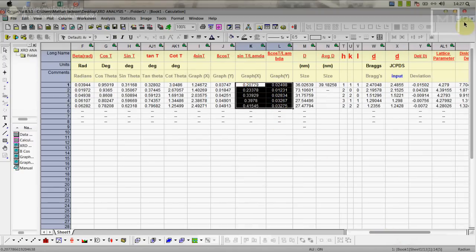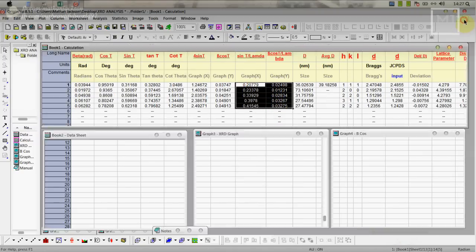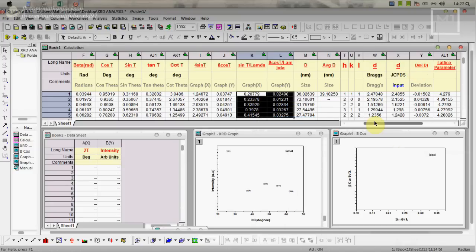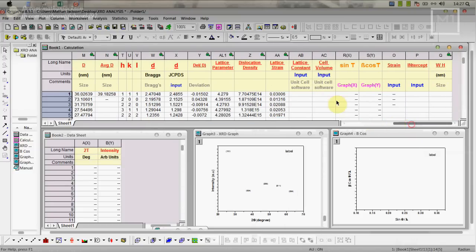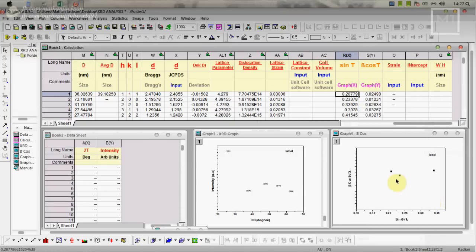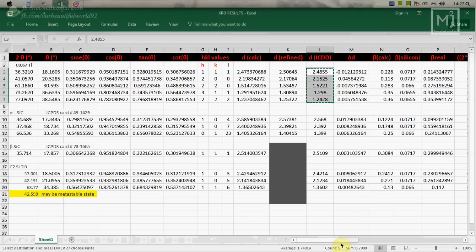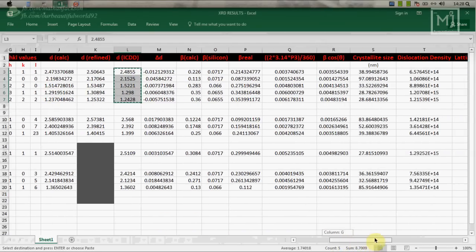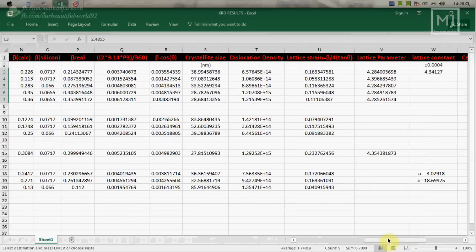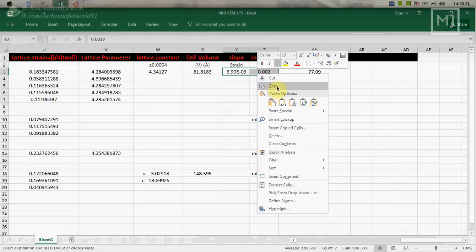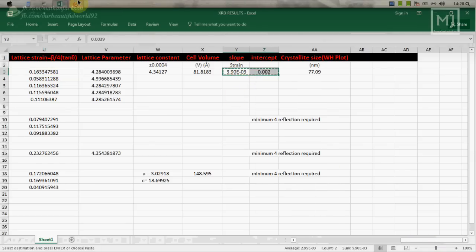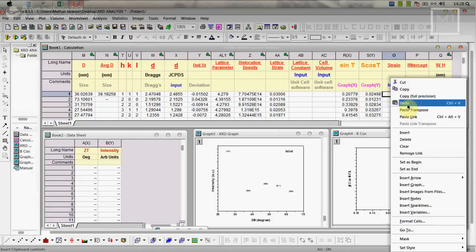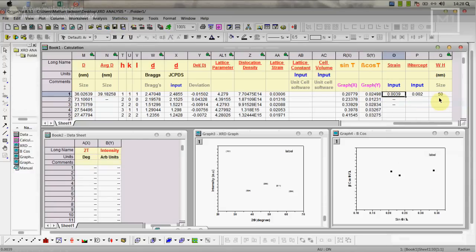From here we have to take these two values. Minimize this, just copy these values and go here and paste the values. Now you will obtain your WH plot here. From that plot you have to do linear fit and get these two values. We already have these values: slope and intercept. This is strain so copy this and paste it here. We get the particle size 50.